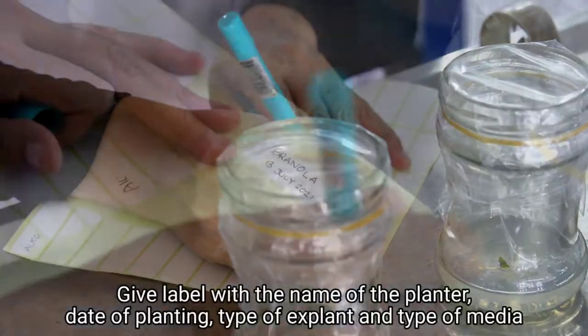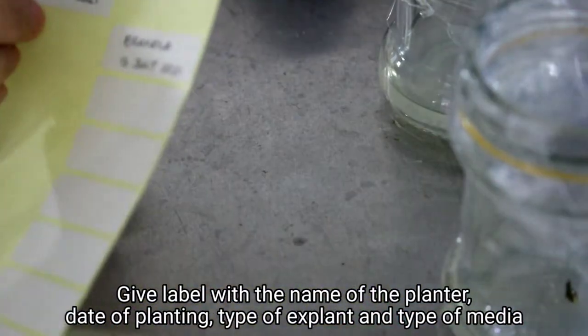Give a label with the name of the planter, date of planting, type of planting, type of explant, and type of media.